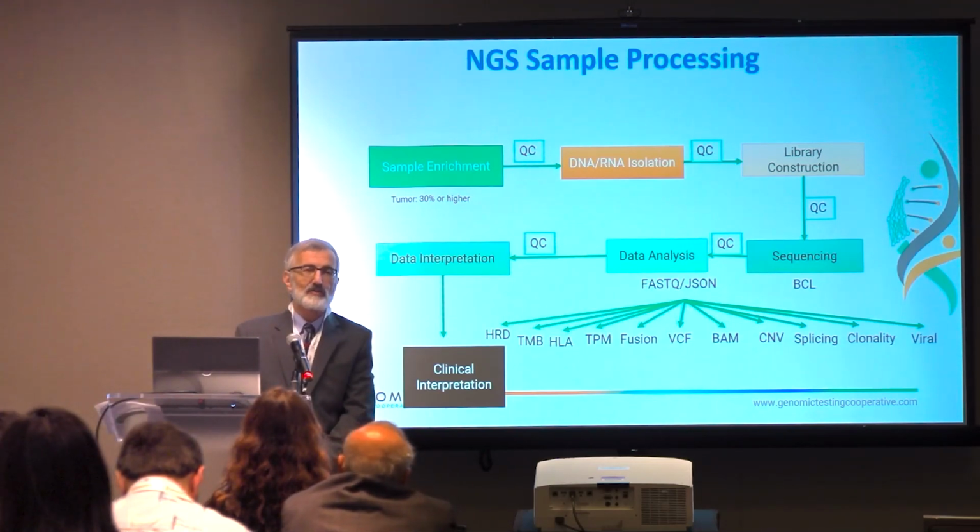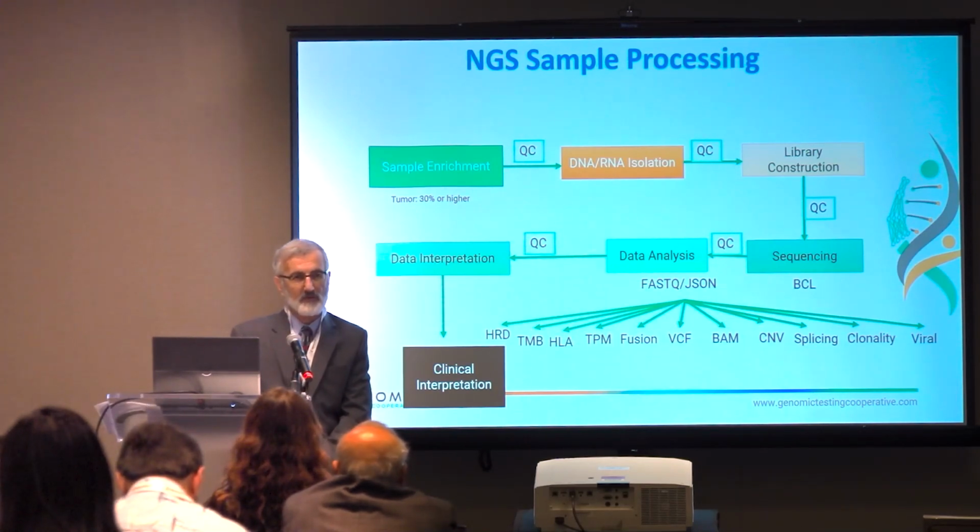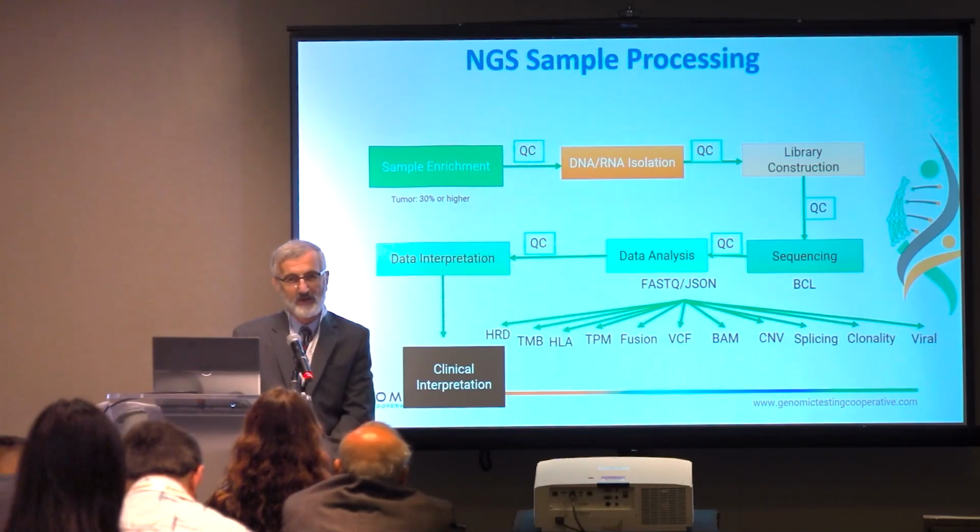And this is why, in my opinion, you have to tailor your software for your own chemistry, for your own technologies. There are multiple companies out there that tell you, oh, we have the pipeline for analysis. All you need is to run it on your instrument and send us the data, and our pipeline can analyze the data for you.